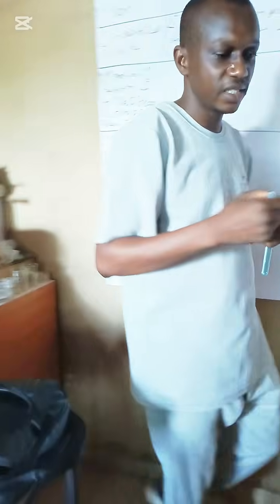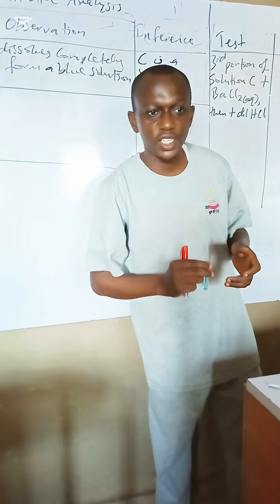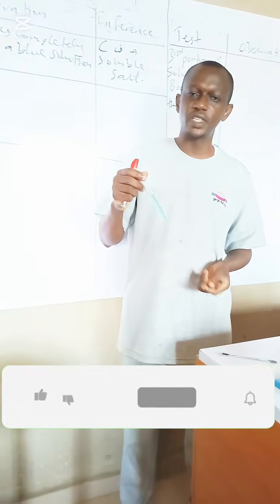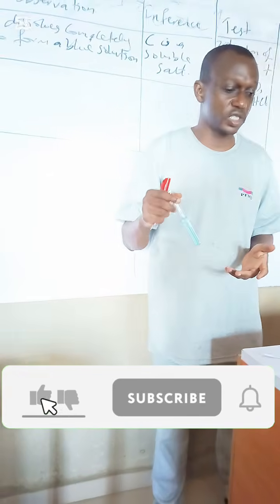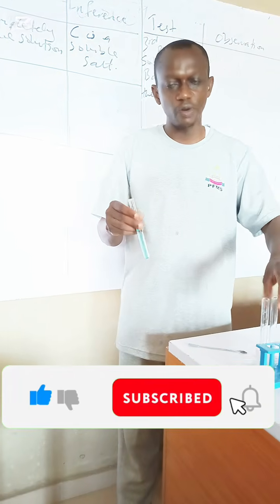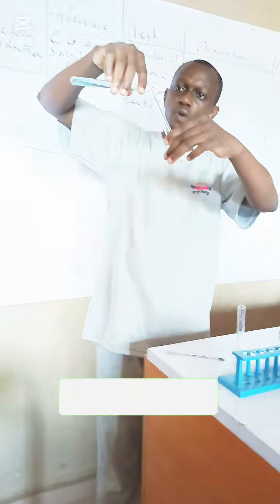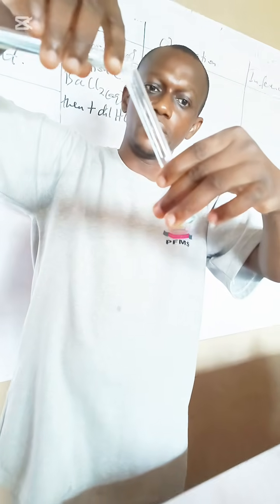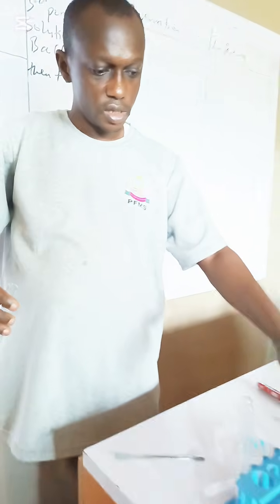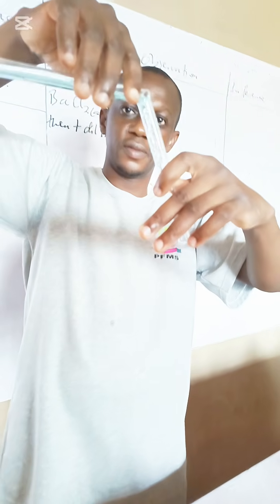So the next instruction is the first portion, which means in your normal examination there will be an instruction for you to split it into 3 portions or 4 portions, as the case may be. So now, as I want to do it now, I will split it into 3 portions. Which means that we have 1 portion here, and we have another portion here.